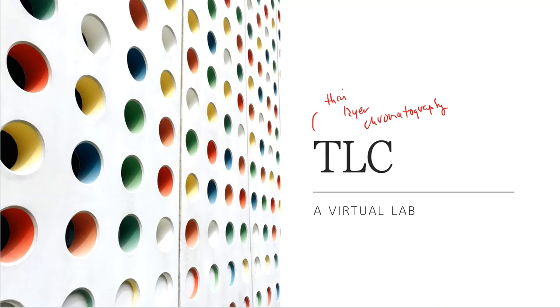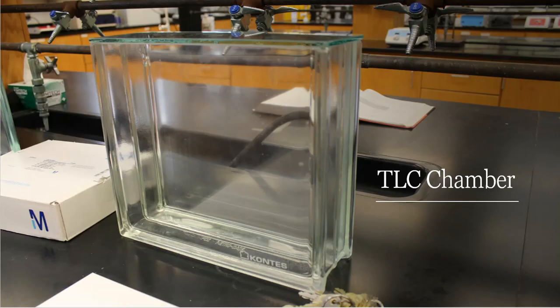All right, so here is a TLC chamber that I decide to use in our lab. We go fancy here. We spend hundreds of dollars on two TLC tanks, because we have very large plates that we like to run most often, and I don't really settle for beakers. If you're doing this in a normal organic lab with a larger class, they'll probably pull out the beakers and tell you to put aluminum foil over the tops, and I just think that's kind of skanky, and I don't like it.